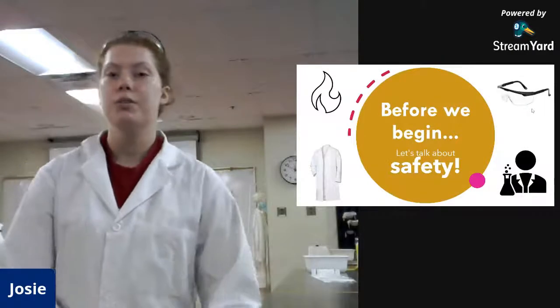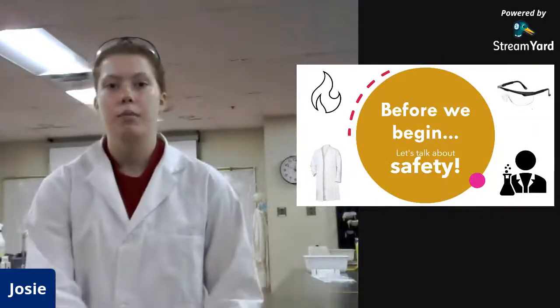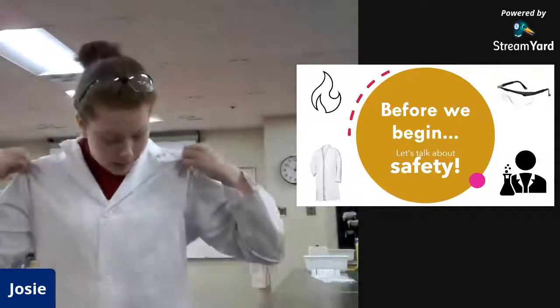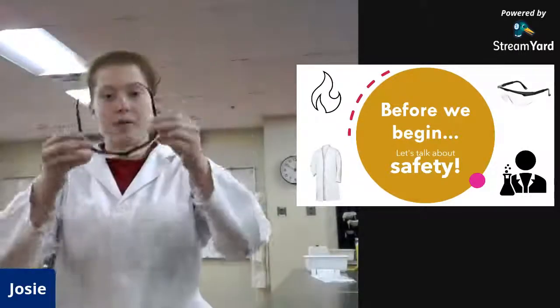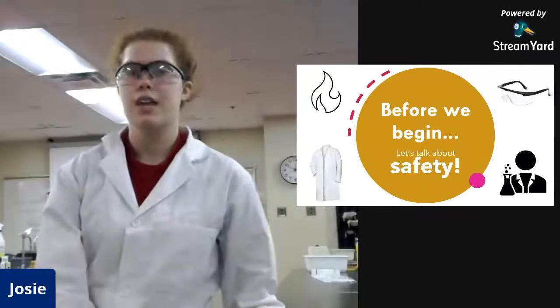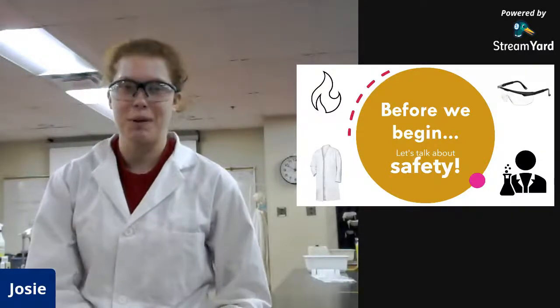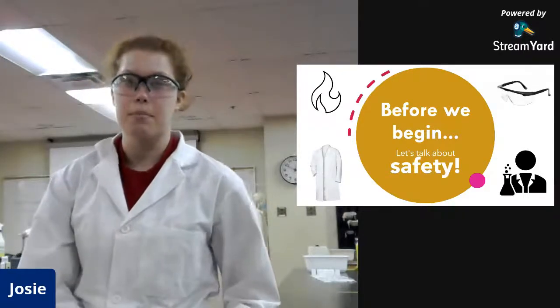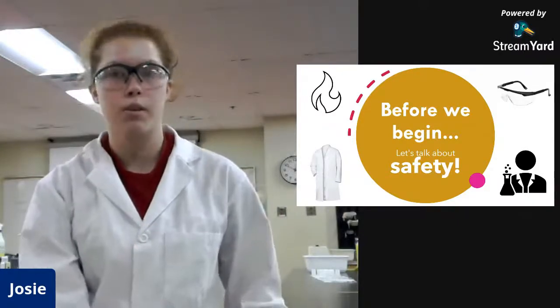So before we start doing any experiments, we want to talk about safety. As you can see, I have my lab coat on, and I'm going to put my safety goggles on before we begin. And it's also good to say that you don't really want to try these experiments at home unless you have someone supervising you. And even then, it might be a little too risky to do these at home.